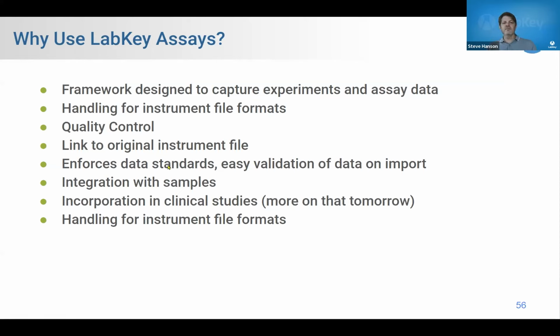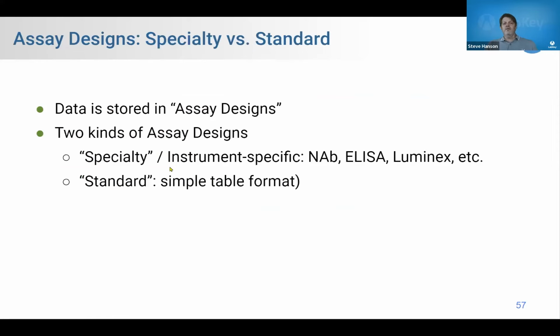So these are some of the highlights, great reasons to use assays in LabKey. Now, the assay framework is complex. So let's back up and get a lay of the land here. First of all, data is stored in something called an assay design in LabKey. And an assay design is one of the big 5 data structures. We're going to do data structures next. But just to put that in context, assay designs are one of the big 5. They're a table type.